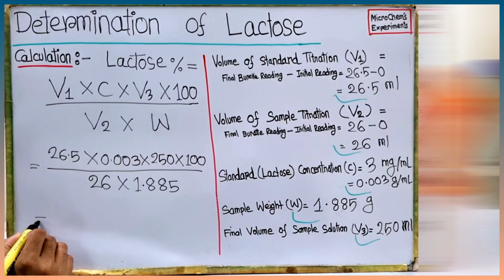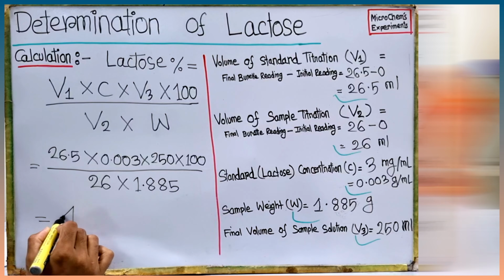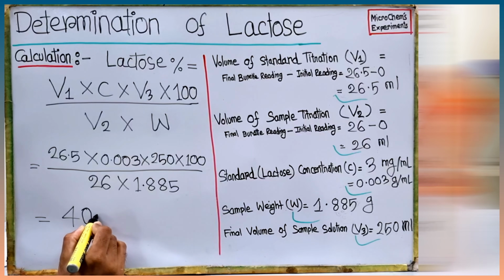By solving the equation, we get the total lactose percent of our sample is 40.55%.